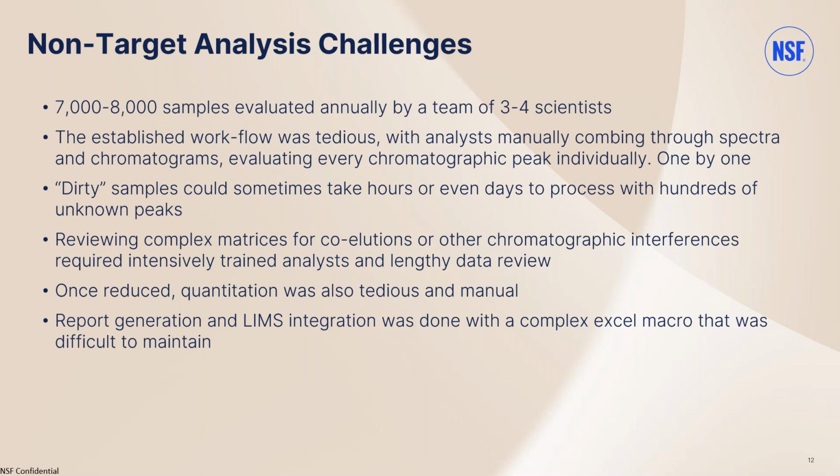And then in order to integrate with our LIMS system, we were using sort of a legacy Excel macro that we had no ability to modify or maintain. So that was a pending issue as well. And as a result of all these challenges, the sample backlog could get up to 6 months at times.